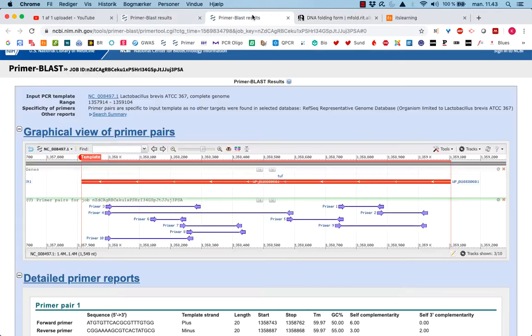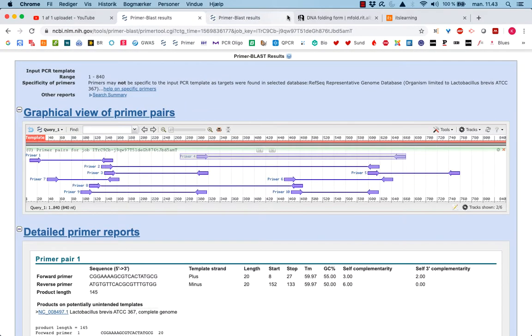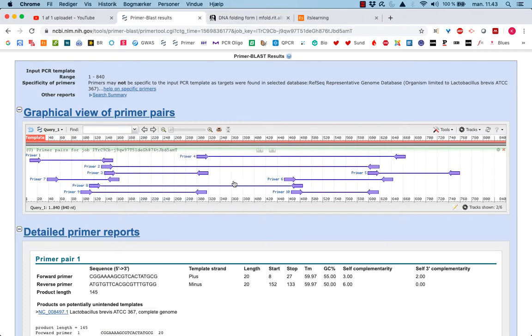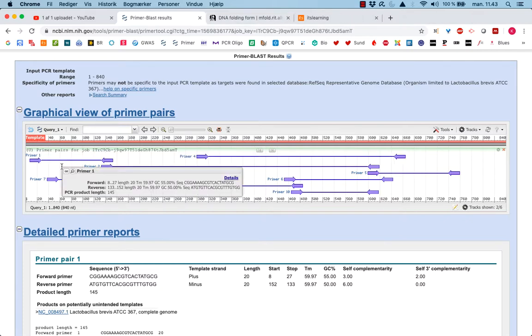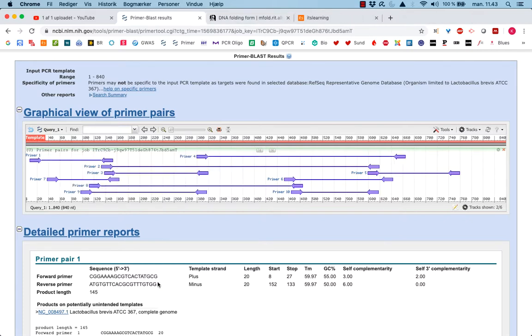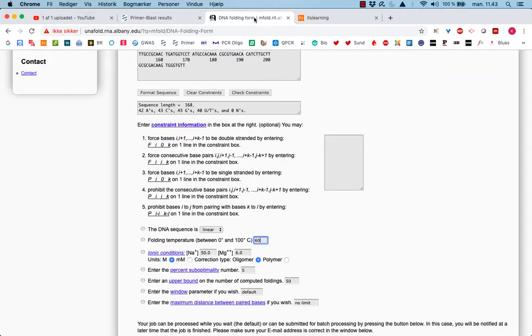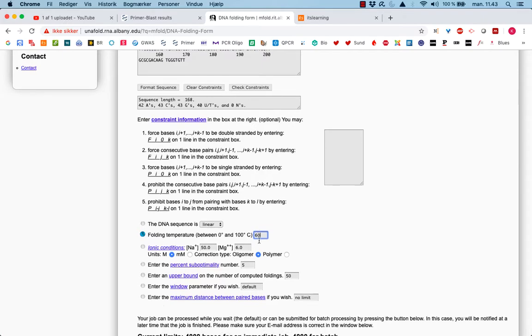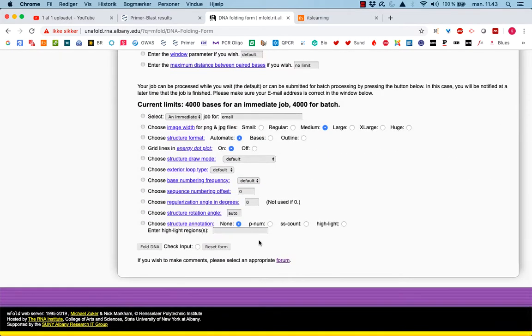Here, you can see the temperatures. If we look at E, this is the right one. Here we are. An annealing temperature, 59.97, that's 60 degrees. So if we put that in instead. And then we say Fold DNA.